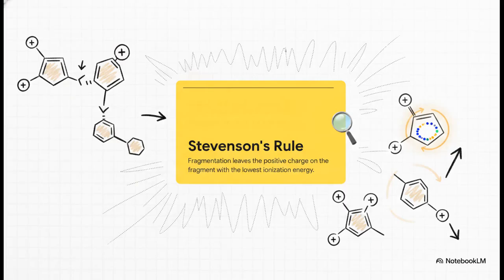Finding the molecular ion and spotting those halogens is really just step 1. To truly solve the 3D structure, we have to understand exactly how the molecule breaks apart. Under electron bombardment, chemical bonds do not just break randomly. They fracture at various specific weak points following strict chemical rules.